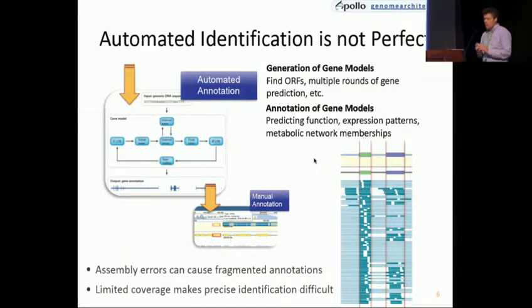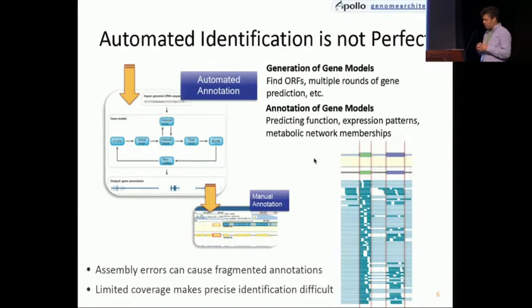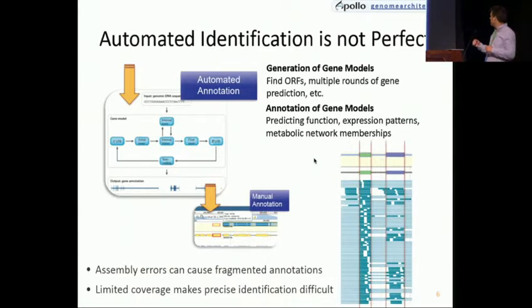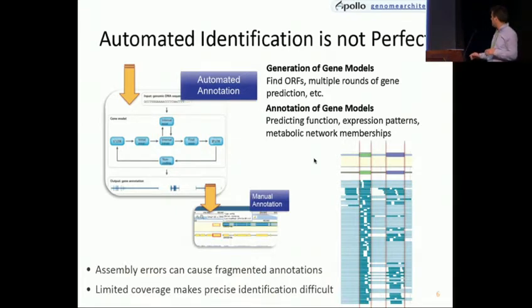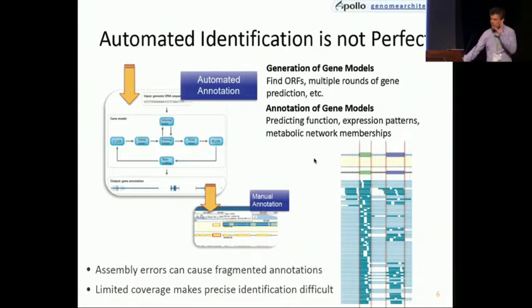Automated identification is not perfect. We have a ton of different tools for identifying and annotating genes from raw data. Typically these go through a round of finding ORFs, doing multiple rounds of gene prediction, predicting functions, expression patterns, and so on. The problem is if there's errors in the assembly or you have limited coverage, precise identification can be difficult and your scaffolds may not be assembled properly. You can see an example on the left — a green exon perfectly lined up, any computer could identify it easily. On the right, the BAM reads aren't quite lining up correctly, so you might need additional evidence or a human eye, or something about that biology.